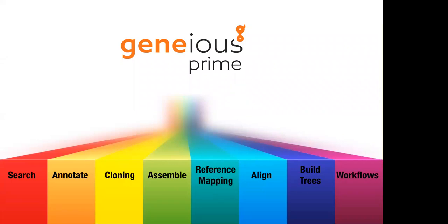And like I said, you can follow up by sending myself an email or sending the support team an email. Rebecca shared that email address in the chat function. I'll also show you where to find it on our website. But also, if you've got any questions as I go, or if there are any other topics you want to talk about, just let me know and I'll try and cover those as well. Like I said, that's the high level overview.